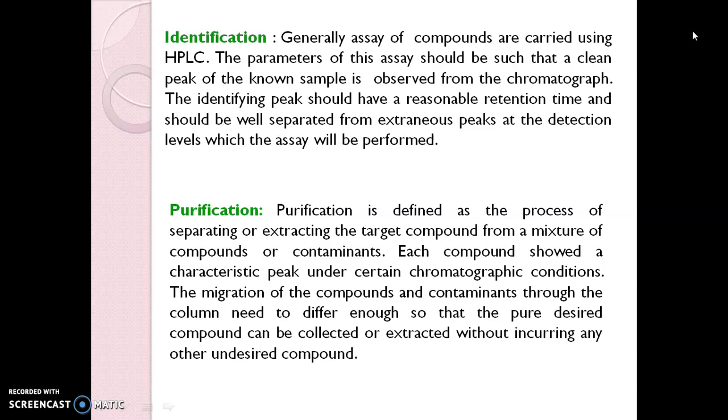Purification is defined as the process of separation or extraction of target compound from the mixture of compounds or contaminants. Each compound should have a characteristic peak under certain chromatographic conditions. The migration of compound or contaminant through the column needs to differ enough so that the pure desired compound can be collected or extracted without incurring any other undesired compound.